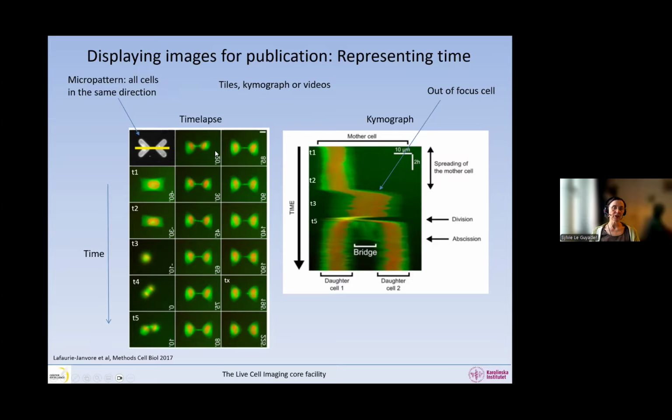And the images can be aligned in such a way that everything is in the same plane, let's say. And now we can make an analysis that looks like that. So we're going to have always this line in the middle like this. And that is the only thing that we are representing here. So every time we have an image, we end up with a line. And this is the intensity in the image along this center line, okay?